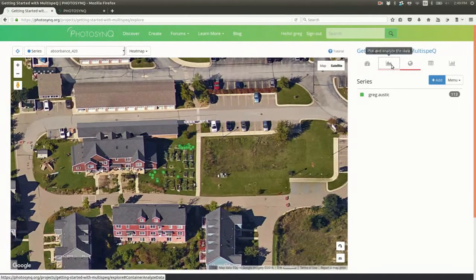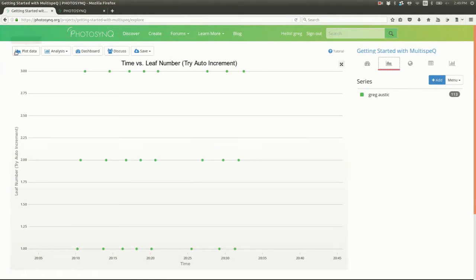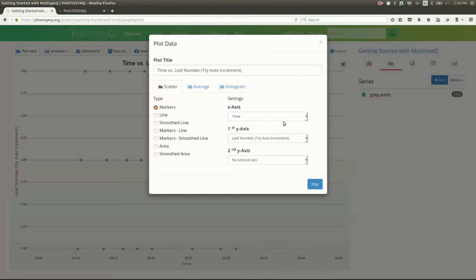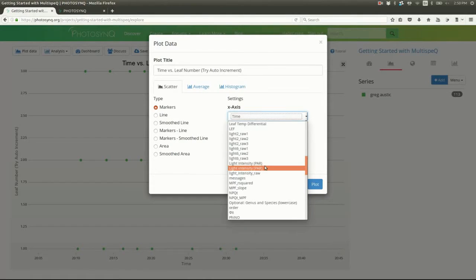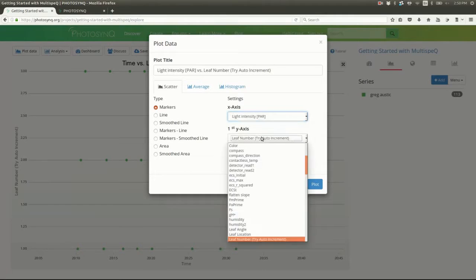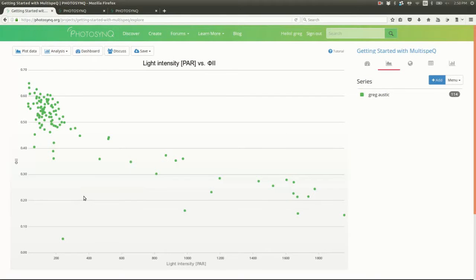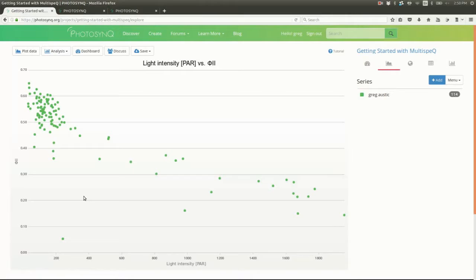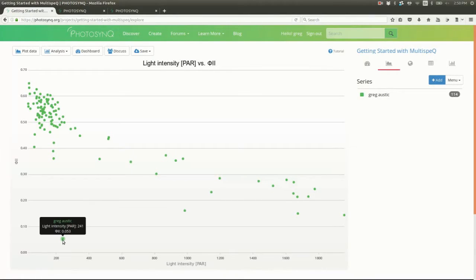Now let's do something more interesting. We'll put light intensity on the X and phi2 on the Y. This is exactly the graph we expect. Photosynthetic efficiency goes down as intensity goes up. But I see an outlier. Let's check it out.